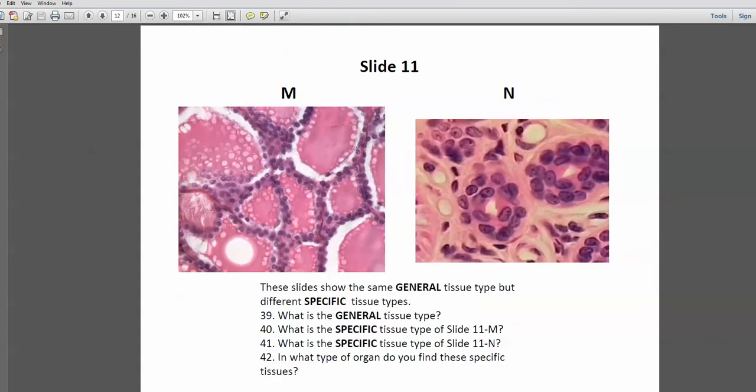Number 11, we've got open spaces and we've got lots of nuclei beside one another. So we know this is epithelial. These nuclei are perfectly round, and cuboidal cells have perfectly round nuclei. So both M and N are cuboidal. But M is simple cuboidal because there's one layer of simple cuboidal cells for M. And in N we have multiple layers, so N is stratified cuboidal. So M is simple cuboidal, N is stratified cuboidal.